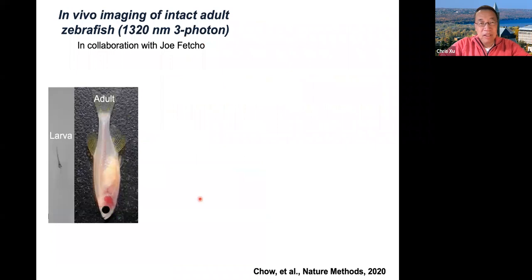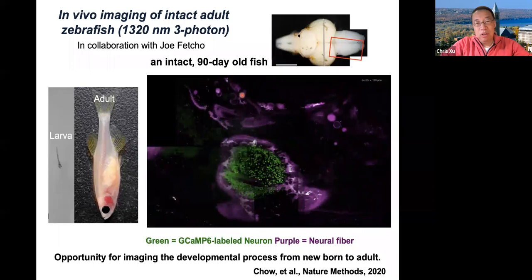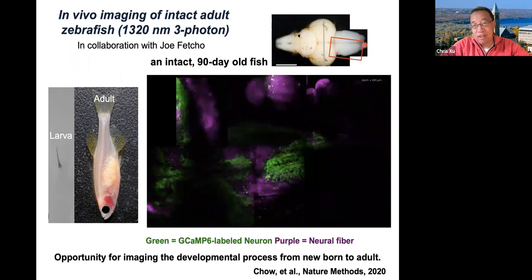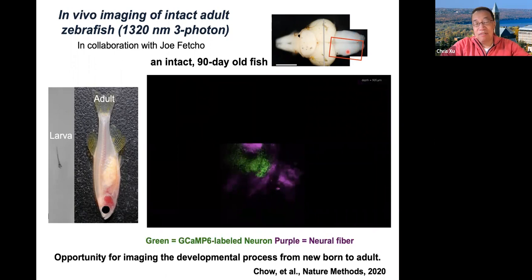We can also look at adult zebrafish, one of the favorite subjects for neuroscientists. Most people look at larval zebrafish — baby zebrafish — because when zebrafish are very young they're more or less transparent. But what about an adult fish? This approach images through the cartilage, through the scales, and reaches the brain underneath. Here is adult zebrafish imaging — three months old, already reaching sexual maturity. Green are the neurons and purple are the third harmonic generation signals. These are tiled together for the telencephalon area, imaging from the surface all the way to the bottom of the telencephalon through an intact fish. This provides an exciting opportunity for imaging the developmental process of zebrafish from newborn all the way to adults.